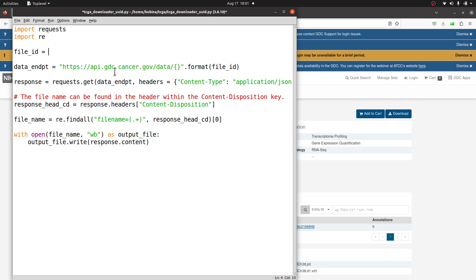Double quotes, and then paste the ID and then another double quote because we want a string data type. This is it. Once you are done that, you don't need to do any other thing.